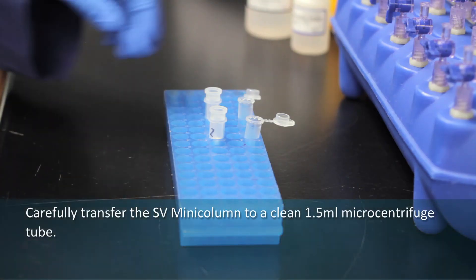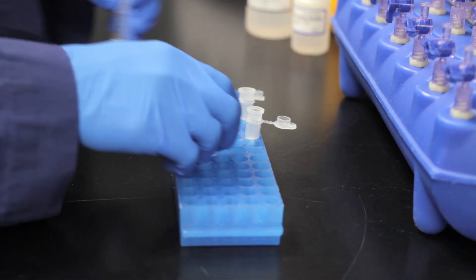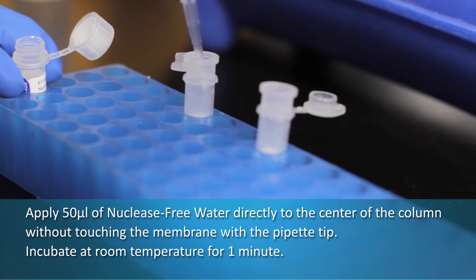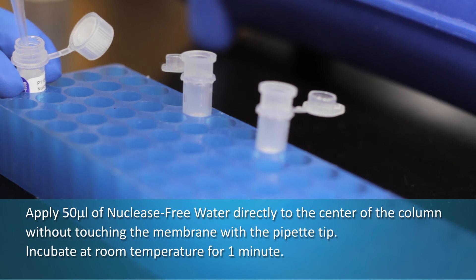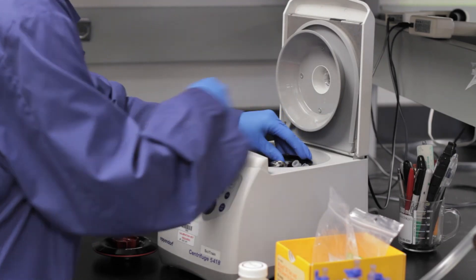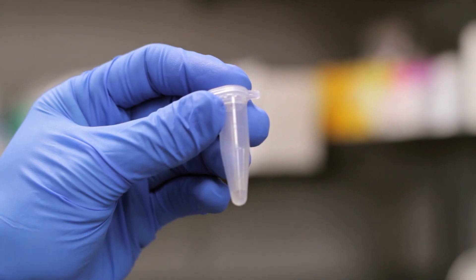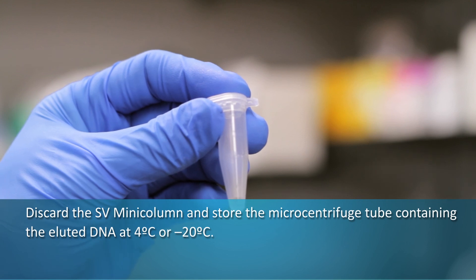Carefully transfer the SV mini column to a new 1.5 milliliter micro centrifuge tube, being careful not to wet the bottom of the mini column with the flow through. Apply 50 microliters of nuclease-free water directly to the center of the column without contacting the membrane. Incubate at room temperature for one minute, then centrifuge for one minute at 16,000 times gravity. Discard the SV mini column and store the micro centrifuge tube containing the eluted DNA at 4 degrees Celsius or minus 20 degrees Celsius.